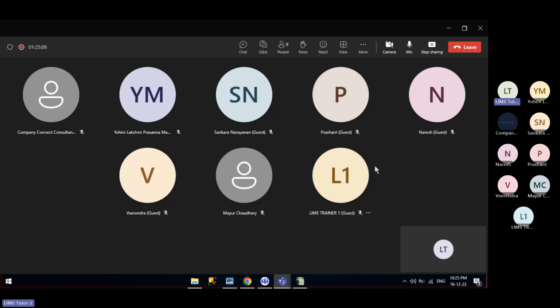As you know, the same product will be marketed in different countries. So the stages, or rather the analysis, will be different.